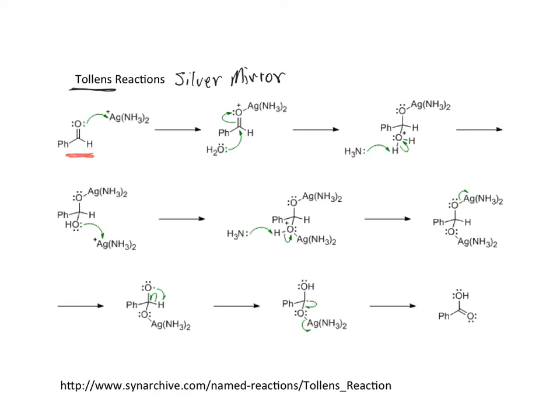Now, the Tollens reaction is dependent on the formation in solution of a silver-ammonia complex.